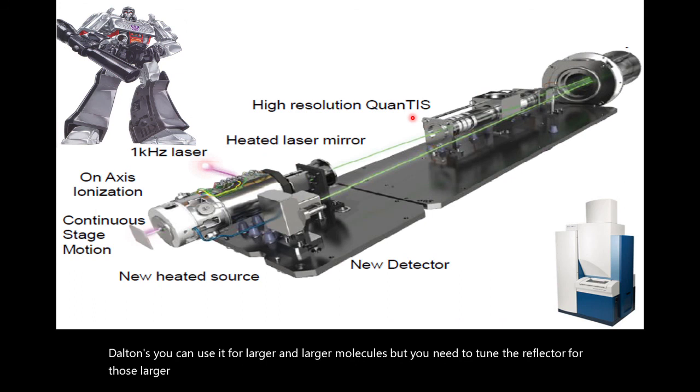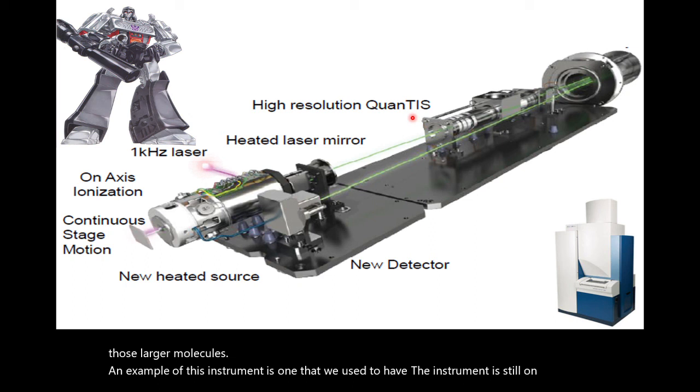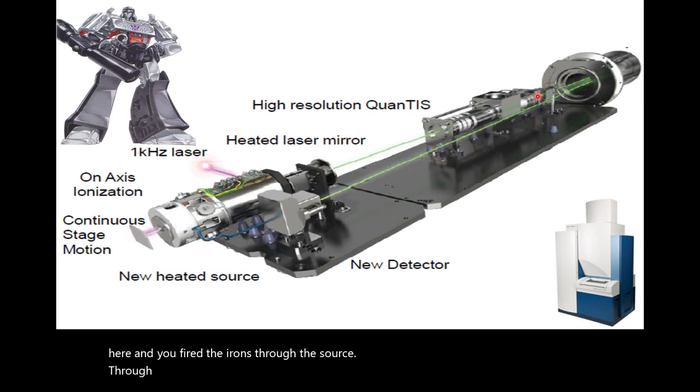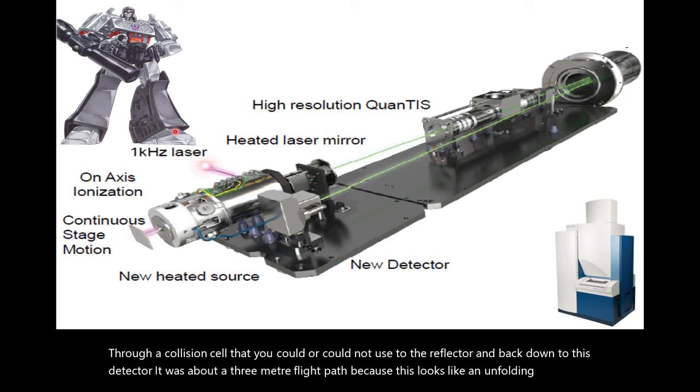An example of this instrument is one that we used to have. The instrument is still on the campus. Unfortunately, it's not operational anymore, where you had your ion source down here and you fired the ions through the source, through a collision cell that you could or could not use, to the reflector and back down to this detector. It was about a 3 meter flight path. Because this looked like an unfolding transformer, one of the academics nicknamed it Megatron, and unfortunately Megatron is no longer functional.